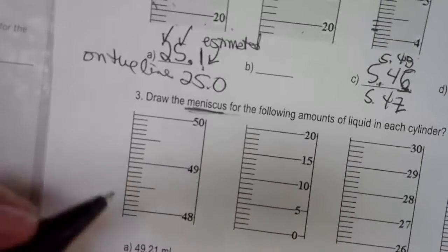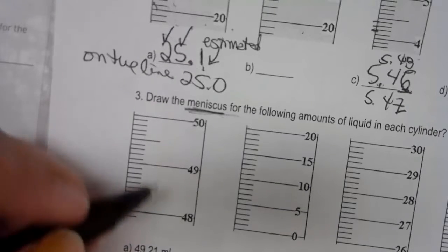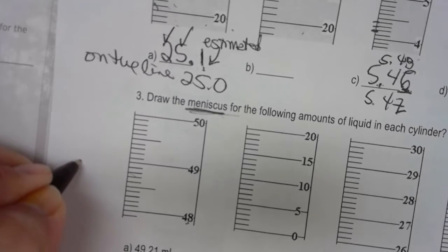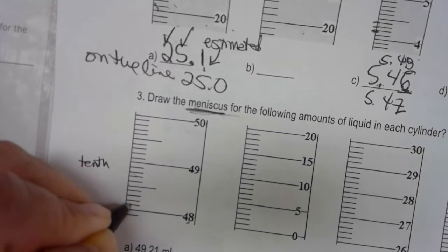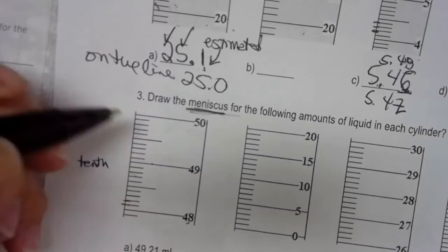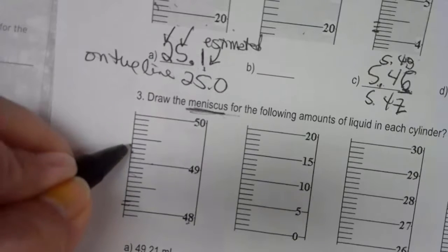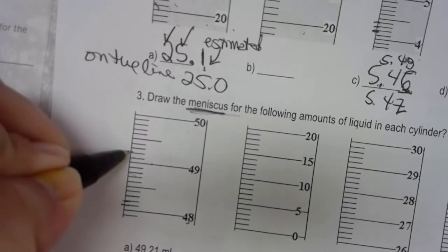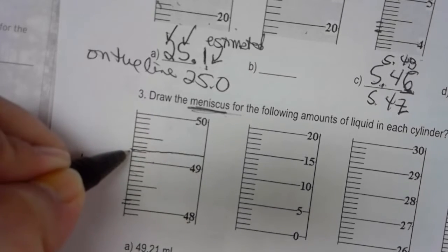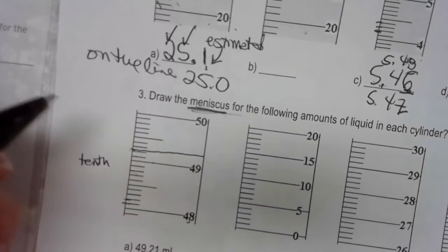So you try to work out the other two, because of time here, I don't want to go on forever, but you also could draw in these units. So here we have between 48 and 49, we have 10 units. So each line is a tenth. Okay, so it's 48.1, 48.2, etc. So you're trying to go to 49, and then you're going to go up the tenth, 49.1. This is 49.2. So you're going to go a little bit above it to the next digit, because that's the estimated one. So you're going to estimate, try to draw a little bit above that line, not exactly on the line, but close to it. You see how it's a little bit above it. Okay, and it should be a little curved, but it's hard to draw that.